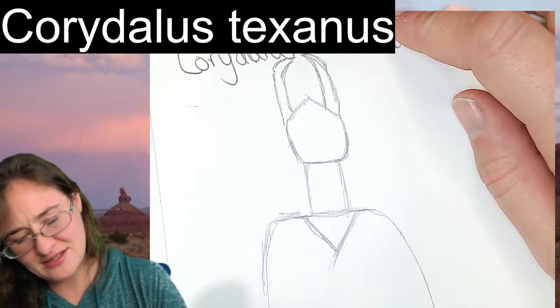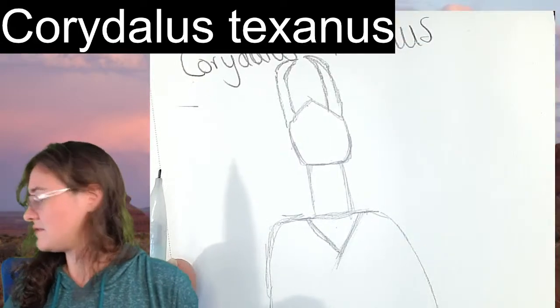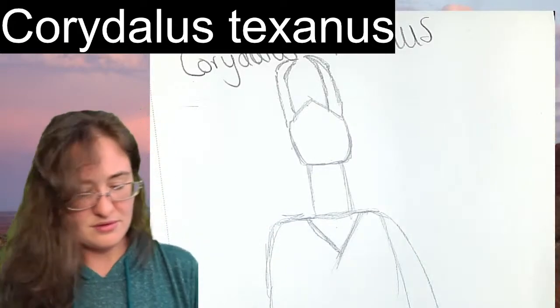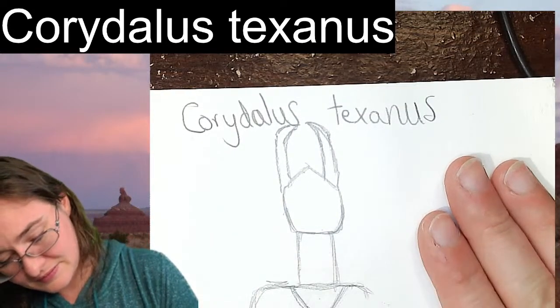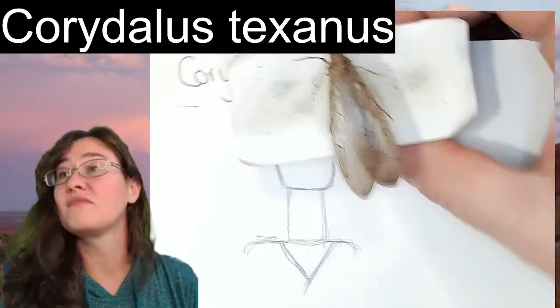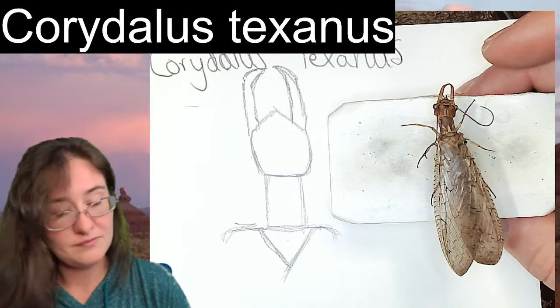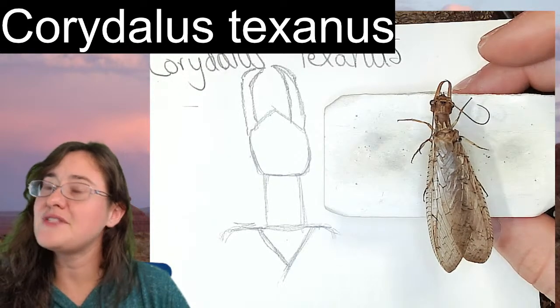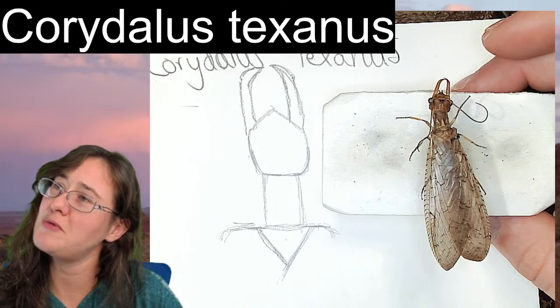Does that make sense? I feel like it's too big. Give me a moment. I have to fix my lines here. I would say it's more like 3 than... No, you're probably about right.